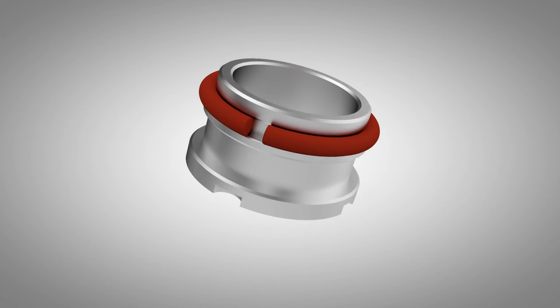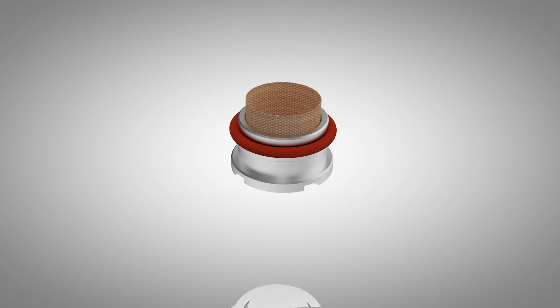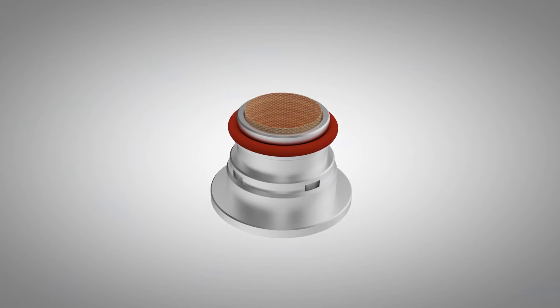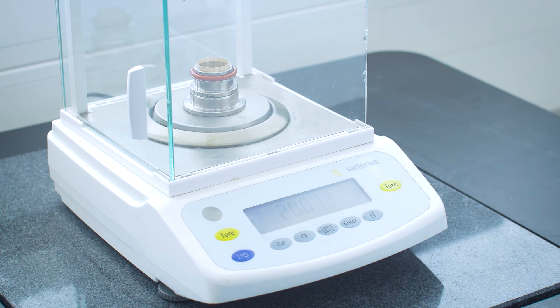At its heart is this miniaturized sample chamber. You insert the separation foils and fill it up with the desired amount of starting material. It is really lightweight and can be placed on an analytical scale.